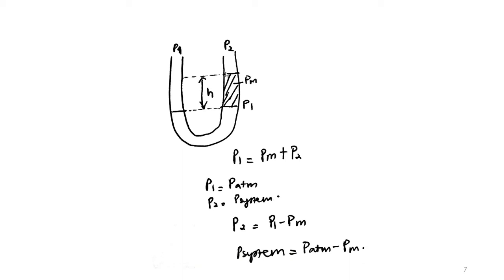Okay, so if you start at a low pressure of the system, then the tertiary butyl alcohol starts boiling. Then when you introduce air, this level will be lower and this one will increase, so then you have a much lower H there. And then you have a new boiling point, because now the pressure is a new pressure. So as I said, PV equals nRT. New pressure means new boiling point. So that's how you do the experiment.